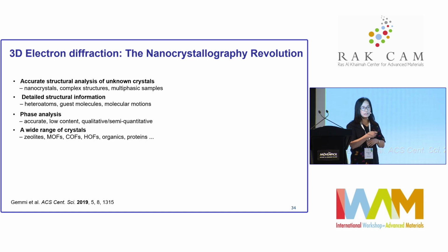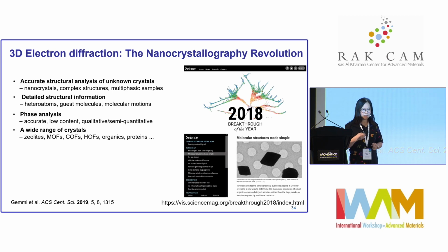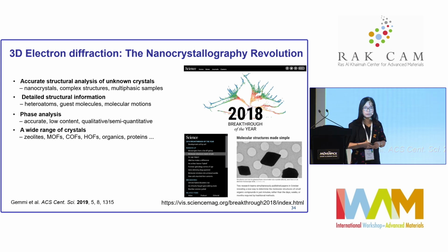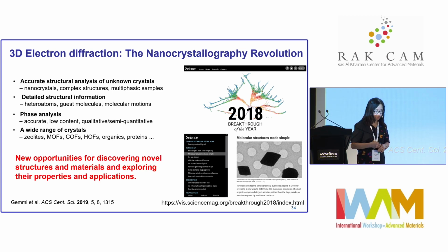And it can be applied to a wide range of materials, from very hard materials to very soft materials. And this has been a very big breakthrough. Like in 2018, it was identified as the Breakthrough of the Year by Science.